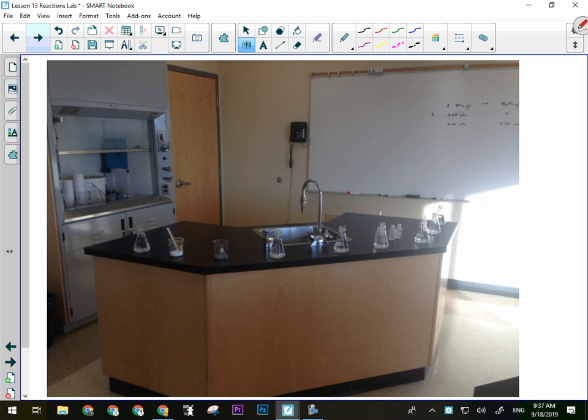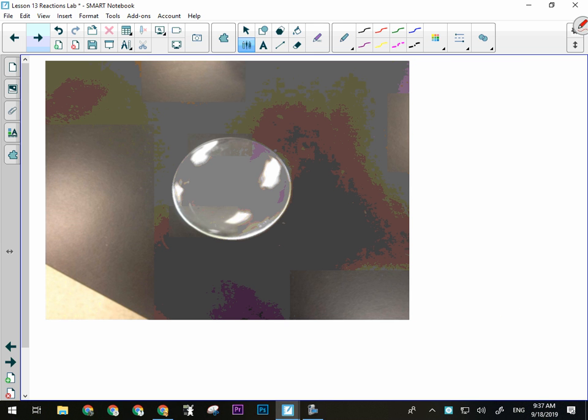These little bottles here, that's the phenolphthalein. It's just in a little dropper bottle, so you pop up this little nozzle and put some drops in, like 4 drops, all you need for this to work. You're going to be doing this in a watch glass, not the depression plates. I know, in the properties of compound lab, everything's really small, but we were trying to save materials. So now you're going to have a bigger container in which to do the experiment. You'll be mixing those 2 things in there.